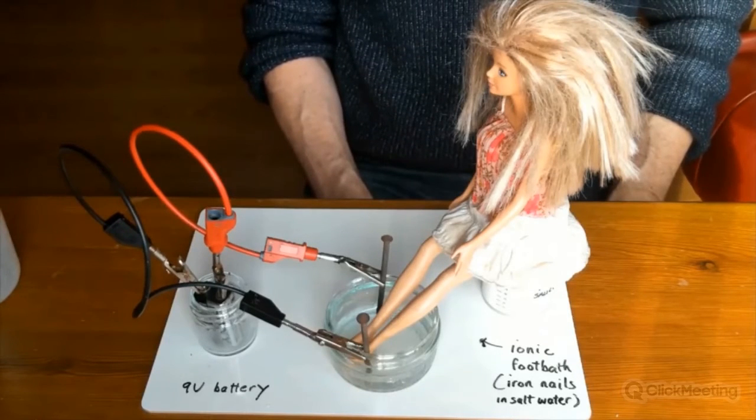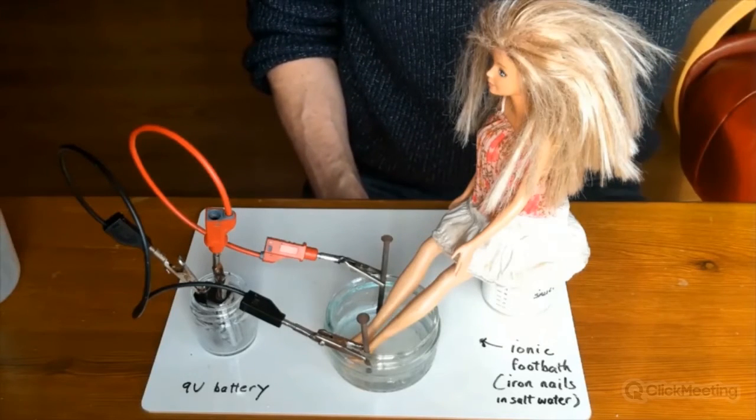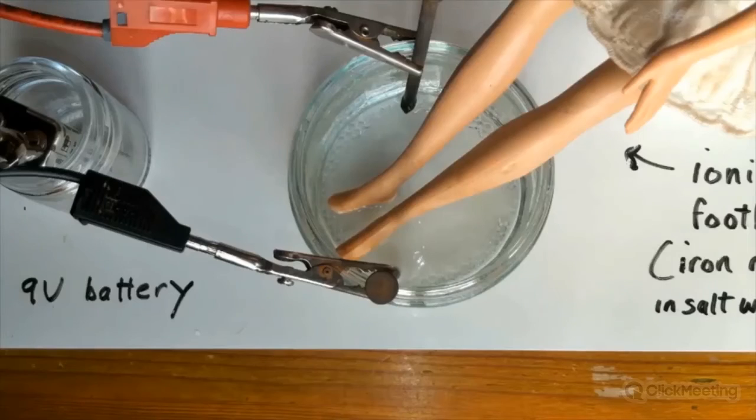So we're going to look at a speeded up, close-up version of what's happening to the dish now. And bizarrely enough, I've got a collection of dolls that the pupils do this with at separate benches overall. So this has been speeded up. So I'm stirring it every 30 seconds.